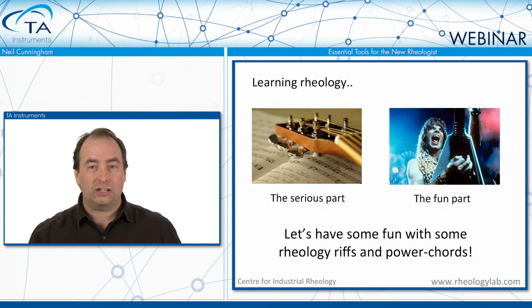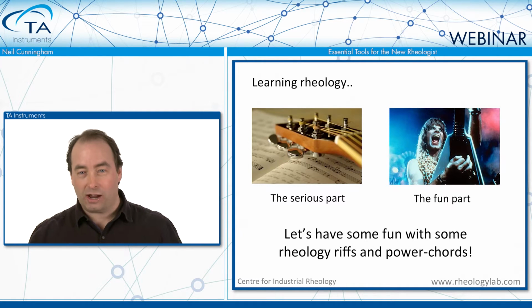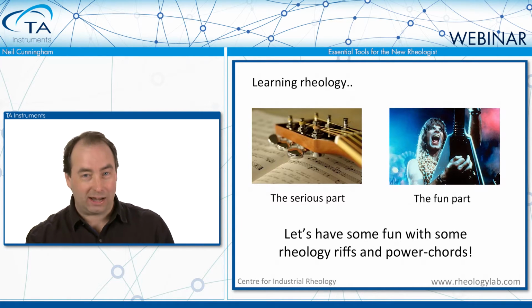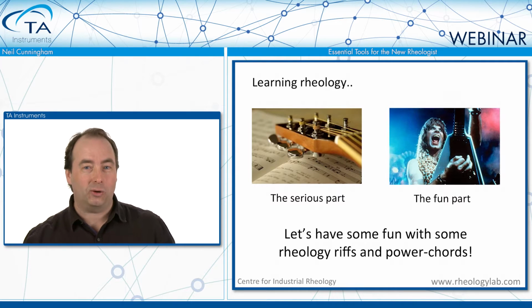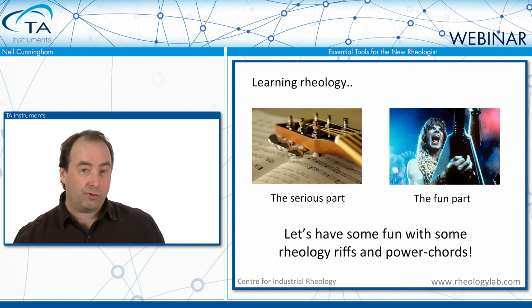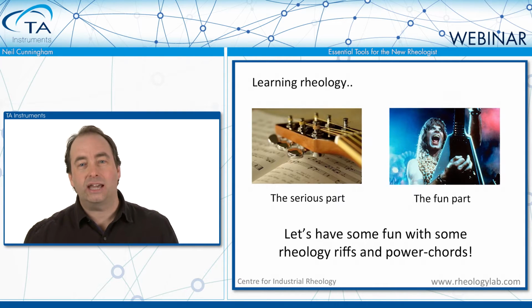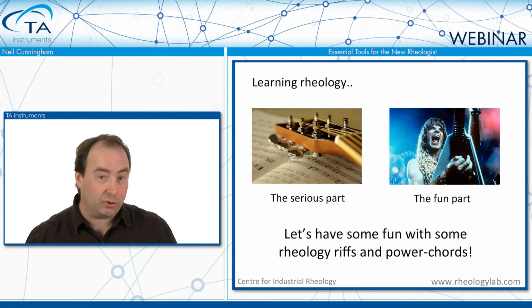But equally, just like the kid who gets his first electric guitar, there's nothing wrong with learning a few classic riffs and power chords, cranking up the volume and knocking out some rock classics. And that's really what I'd like to do today, is to teach you some of rheology's classic riffs and power chords. What these will do is enable you, if you have a rheometer, to get started taking some measurements and get some value out of your instrument.